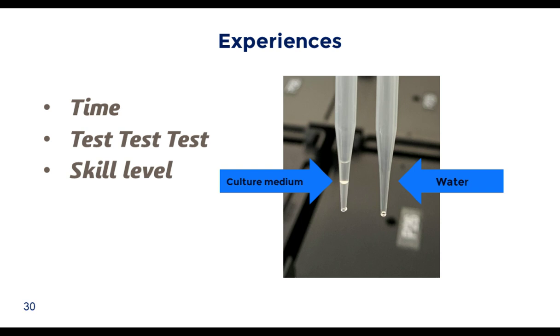Your first run of an actual cell line development campaign requires either full trust in the system, sufficient backup plates, or a simultaneous manual workflow. All of these require additional resources. Trust in the system is developed with sufficient testing. Backup plates require greater equipment use. A simultaneous manual workflow requires human resources, who therefore may not be available for the automated workflow.